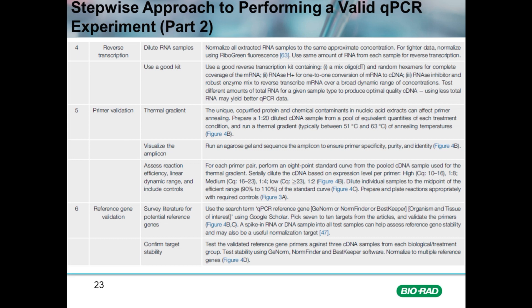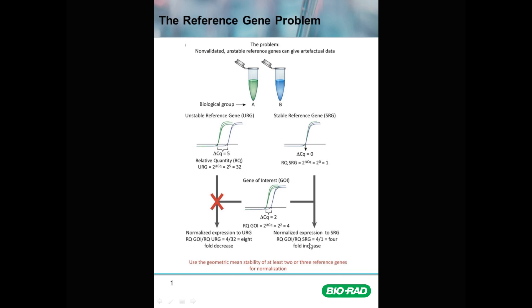The bottom line is that for any given study, a panel of reference genes should always be tested against all of the treatment groups in the experiment — using two or three biological replicates from each treatment or biological group, including control. A full study cohort of samples is required to assure that the reference genes are stable between all treatment groups. The most stable reference genes can then be used confidently to avoid publishing artifactual data consequent to reference gene regulation between treatments.